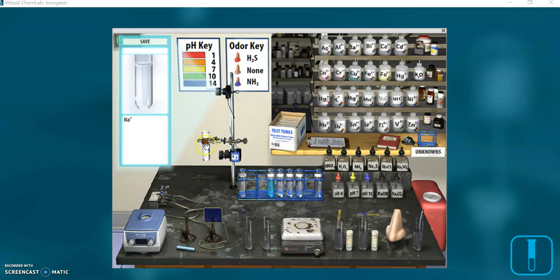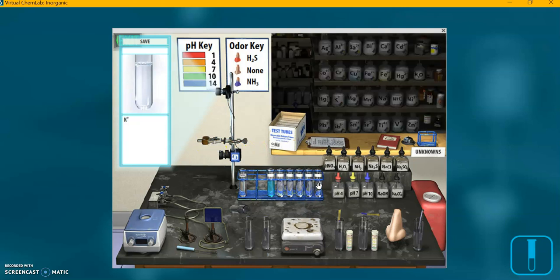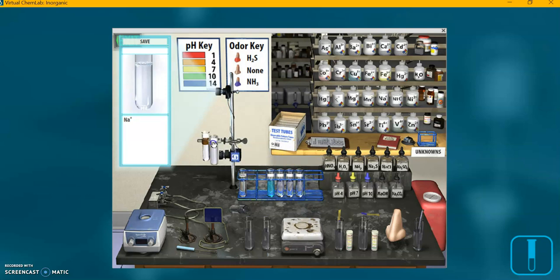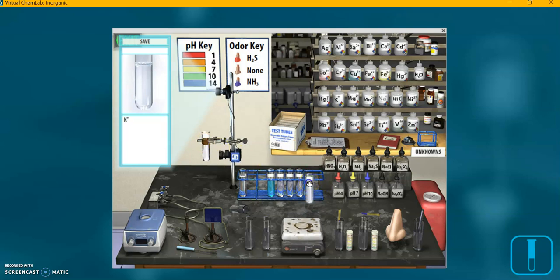Now we're done with the sodium. So we can put the sodium back and grab the potassium, put that in. That's our next one. The other way we can do it, they have a shortcut here in the lab. I can grab, say, grab the sodium and just put it there. And it immediately puts the sodium in and the potassium back. It switches places. I don't like doing it that way as much, but I'll do that again here. So now we have our potassium in there and our sodium has magically appeared back in our rack.